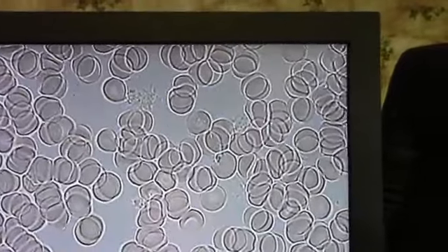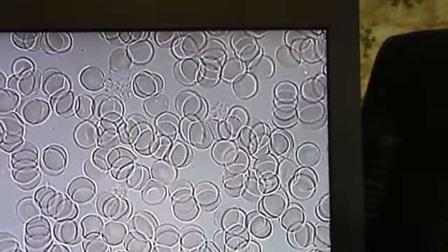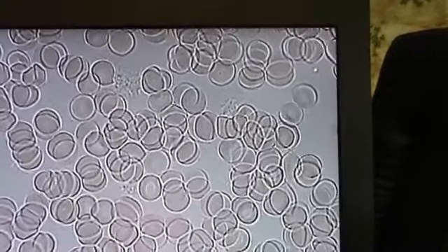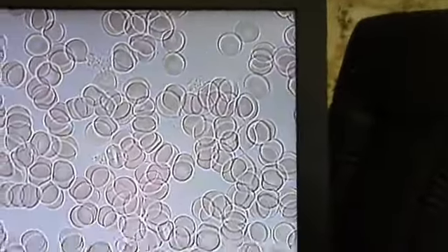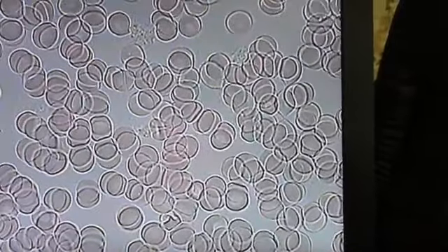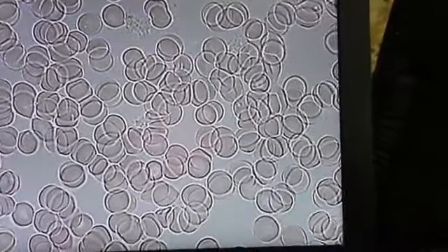And you even got a little bit of the target cells in there. I was just seeing that. So that's the iron, the lack of iron and poor iron absorption. In a lot of cases when we're seeing a lot of digestive issues, he's just not, he may be getting the iron, like he ate a hamburger today, but it doesn't mean that you're necessarily processing the iron from that.